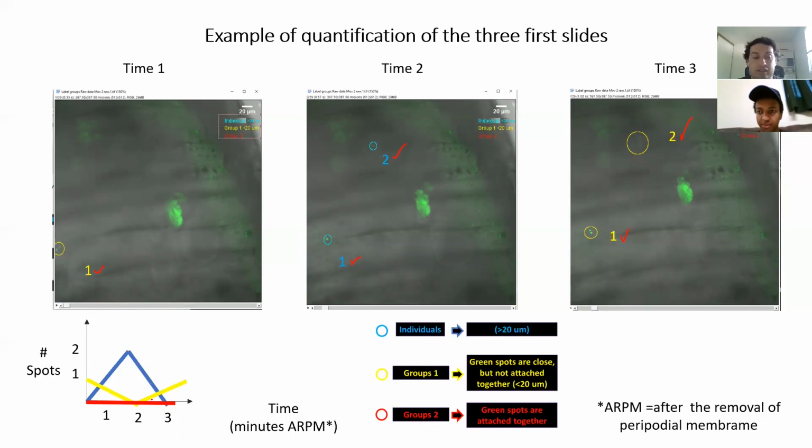And in that way, you can make a figure that could be the first figure of your paper. Let's say what happened. We're trying to evaluate what is the distribution of these spots, and we divide them into 3 groups, and we find that we don't know what we find. We will see, but we can make a diagram. So this will be our temporal distribution. Okay.